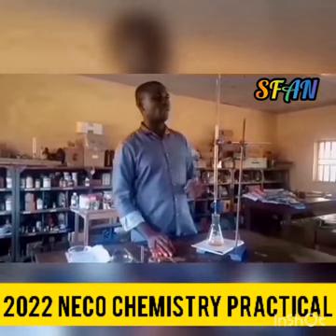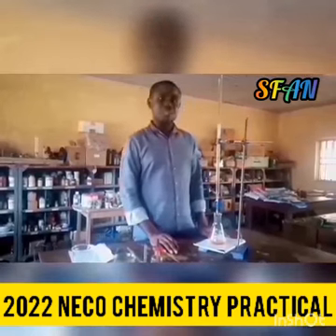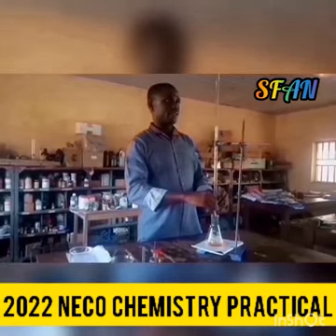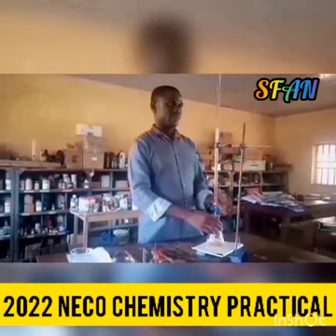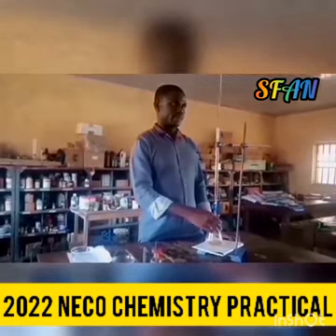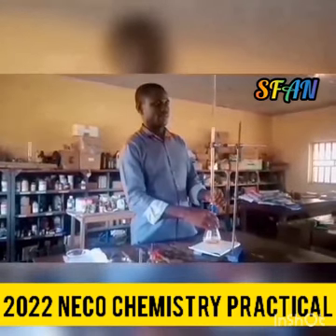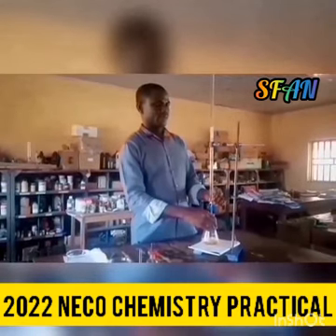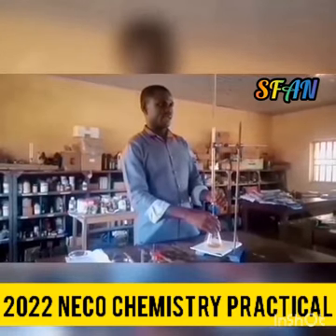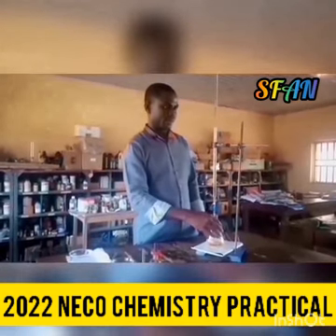So when I'm getting close to 13, I'll start reducing the speed of my titration. This time around, my focus is on the burette. So as I get closer to 13, I reduce the speed.